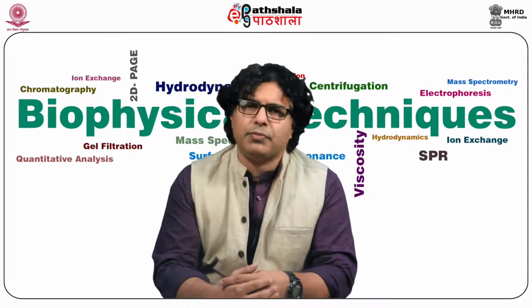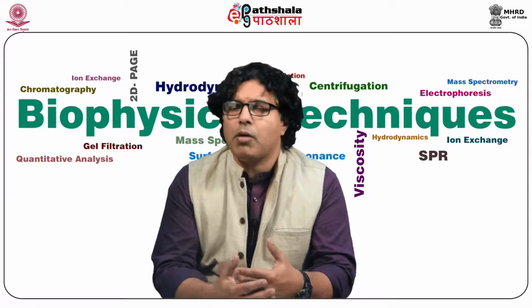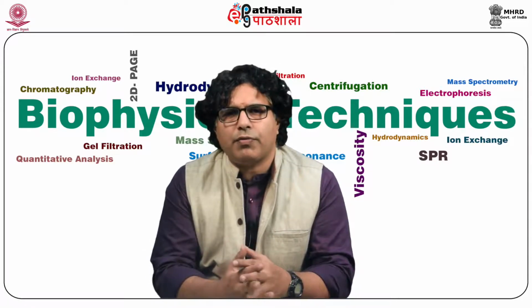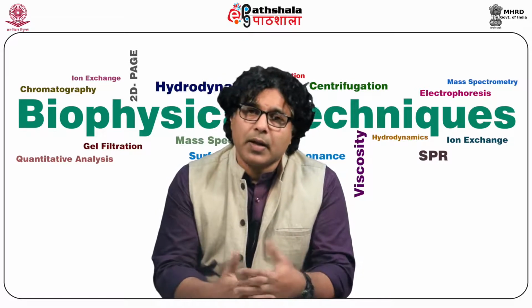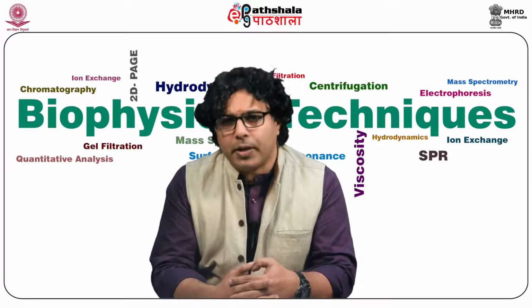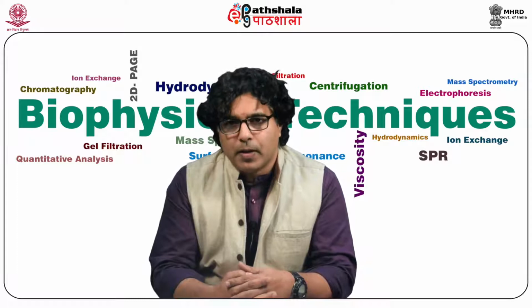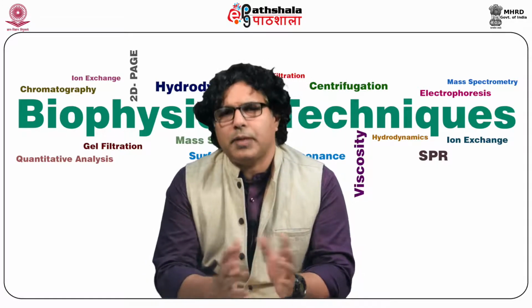Earlier we thought that we wouldn't be able to go above the dimensions of normal HPLC. Today we have gone further and can get a much finer separation than one could think of. So today let me explain more about the HPLC.